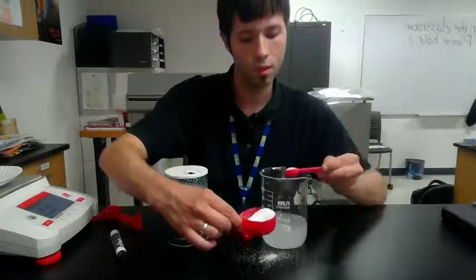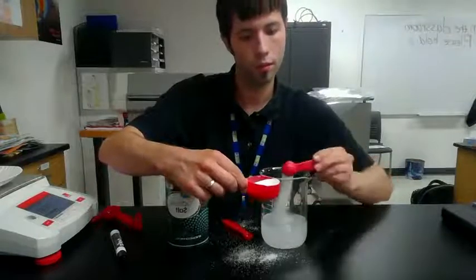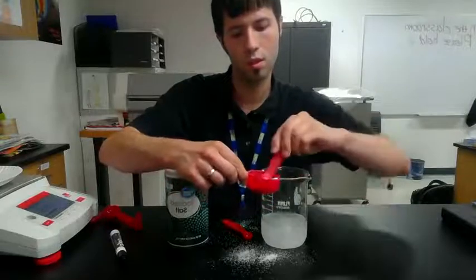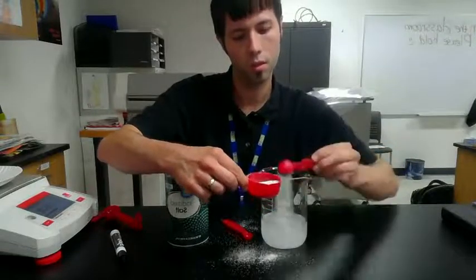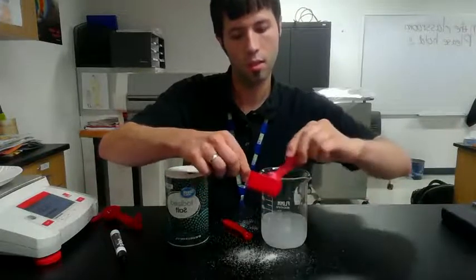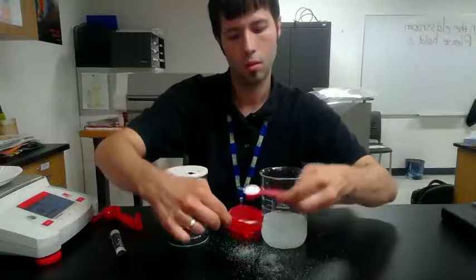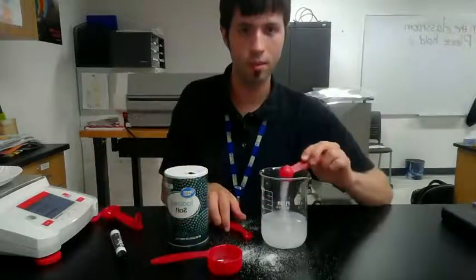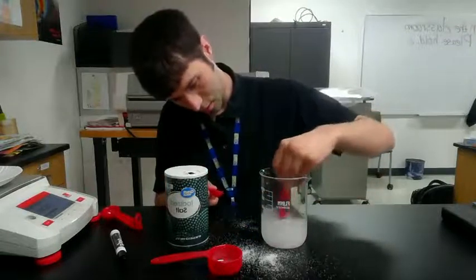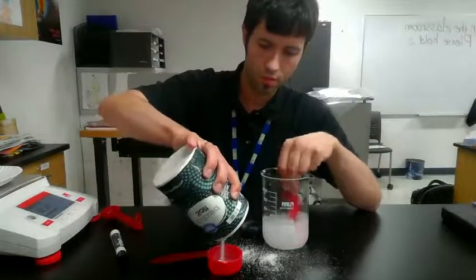Let's see. 4, 5, 6, 7, 8, nine. Yes, I'm making a mess. I'm kind of in a hurry because I only have 5 minutes left on this video. You know, I'm going to need some more salt here.